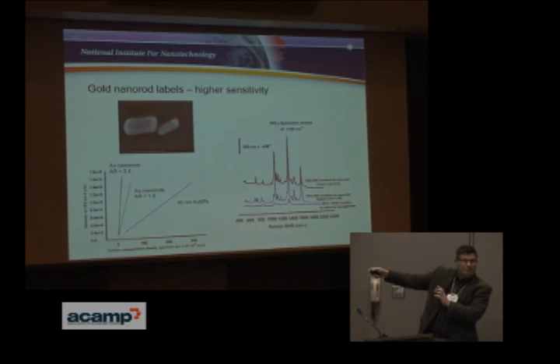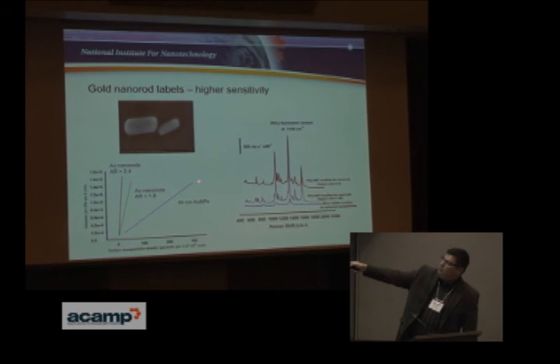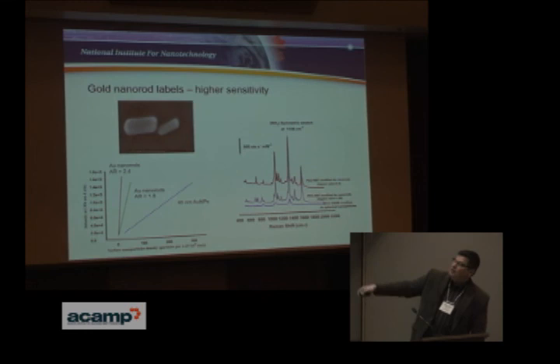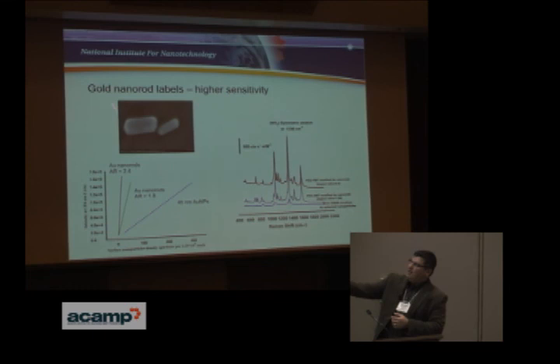This is a plot of the intensity as a function of particle surface density, how many are on the surface. And the blue curve, the blue line is for the spherical particles, and these very steep curves are for the nanorods, which shows that we have much higher sensitivity per surface density of nanorod relative to the nanoparticle. And so that's what we're working on right now.